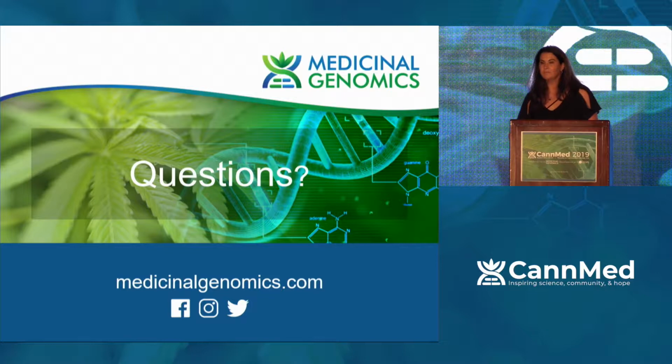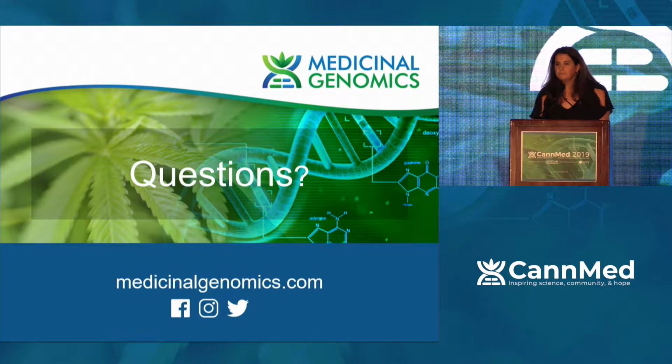Thanks for the talk. Actually, I had a quick question, which might be obvious to folks that are in the industry here, but it sounded as if the microorganisms are dead, then it's not a concern anymore. But if you had like a massive mold infestation on the product and then killed it with radioactivity, would there still be toxins and other things associated with it? I'm just curious why the distinction between living and dead.